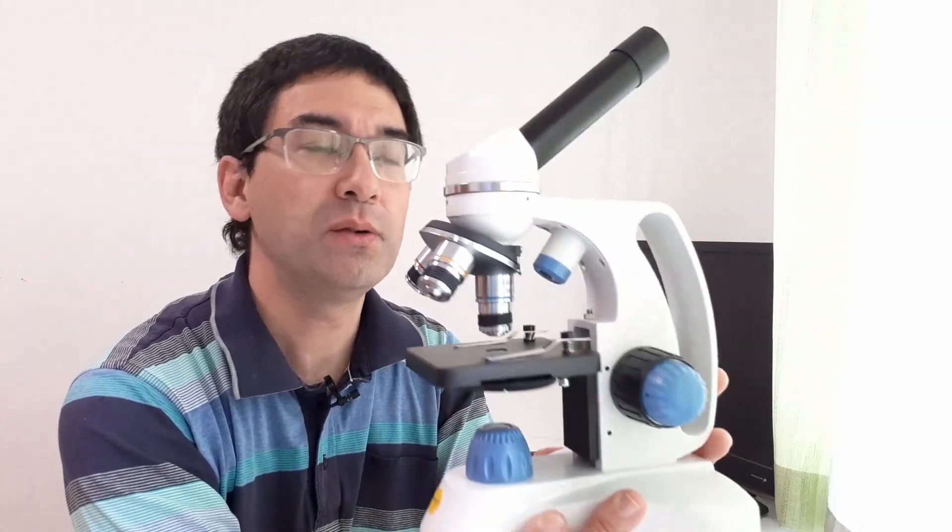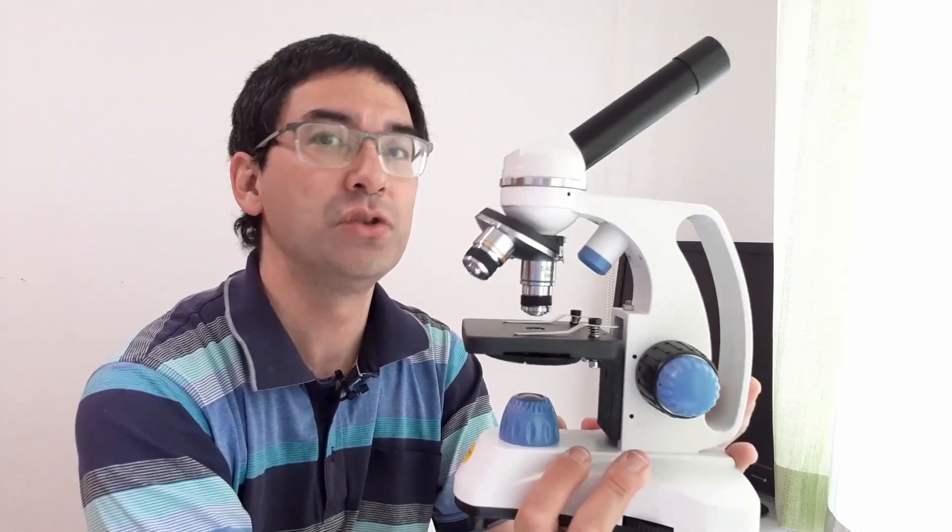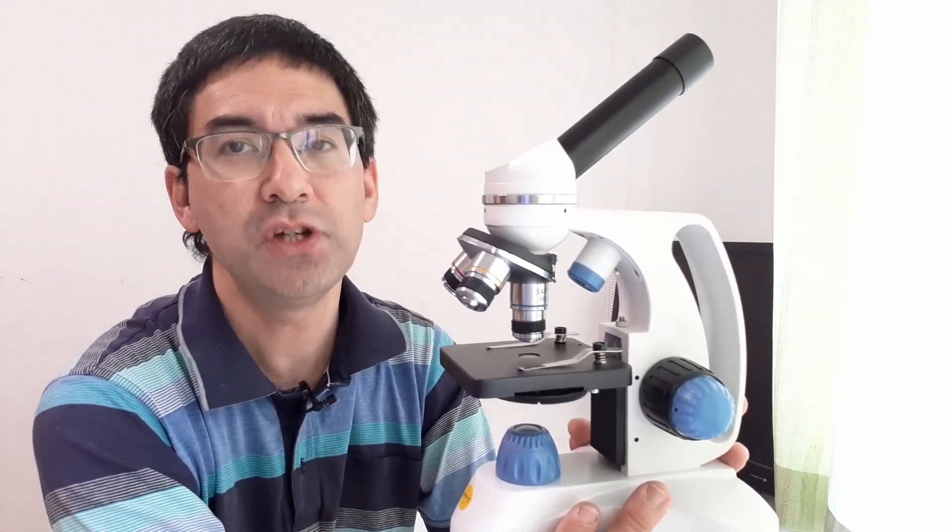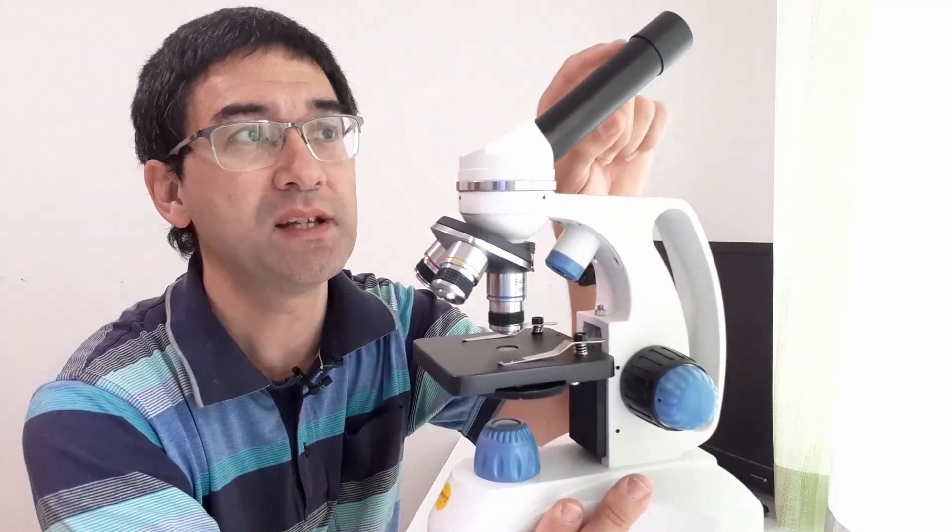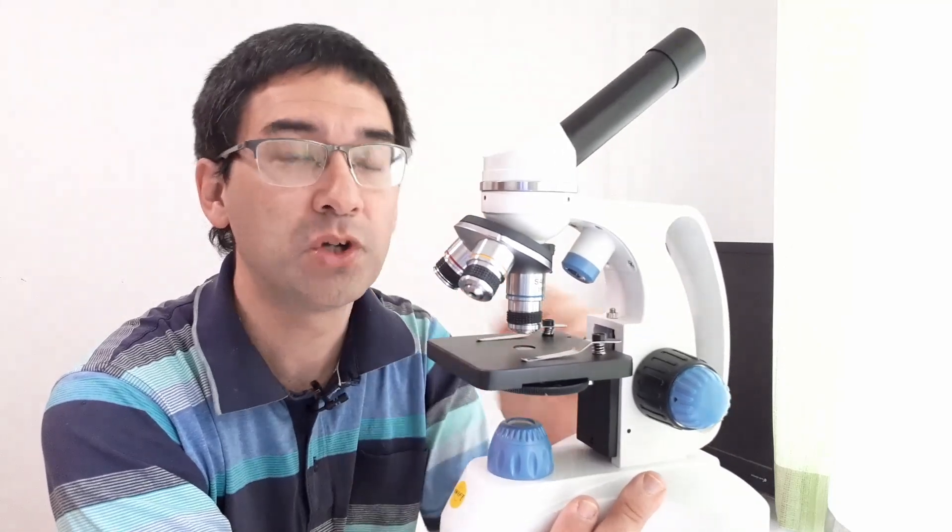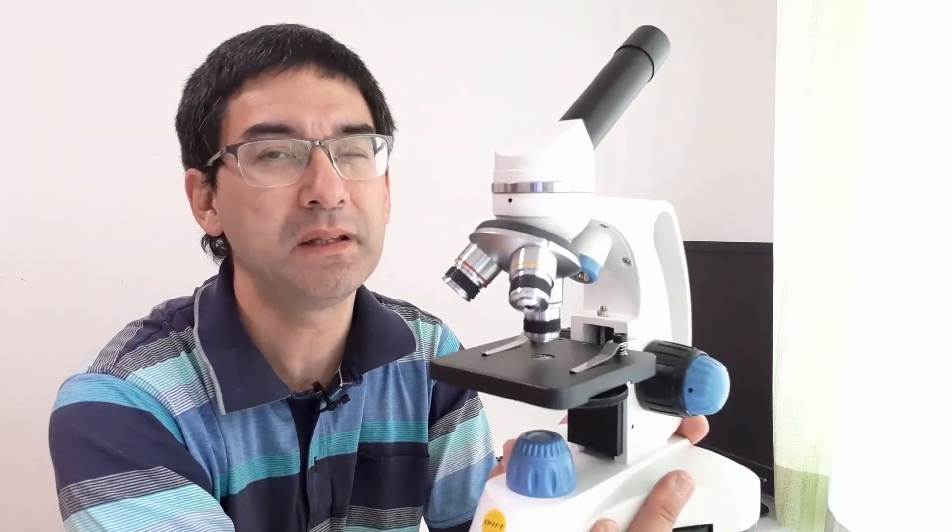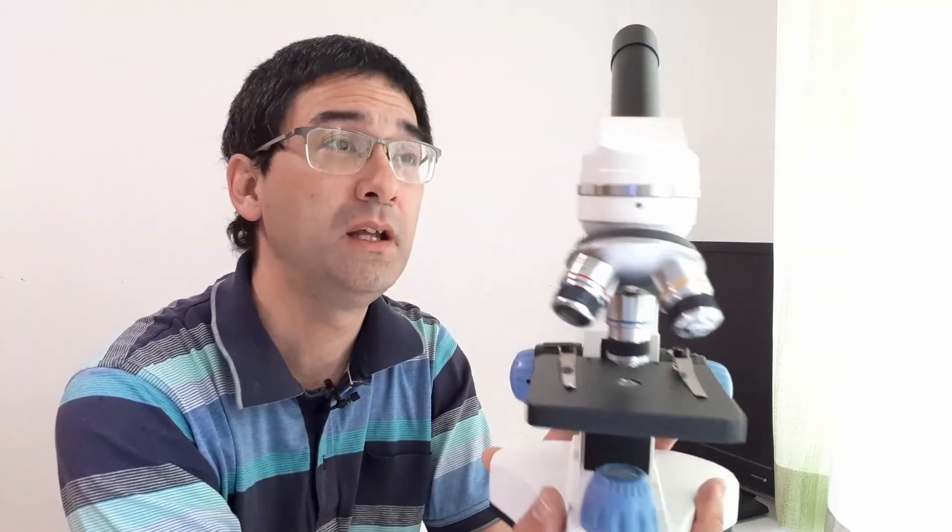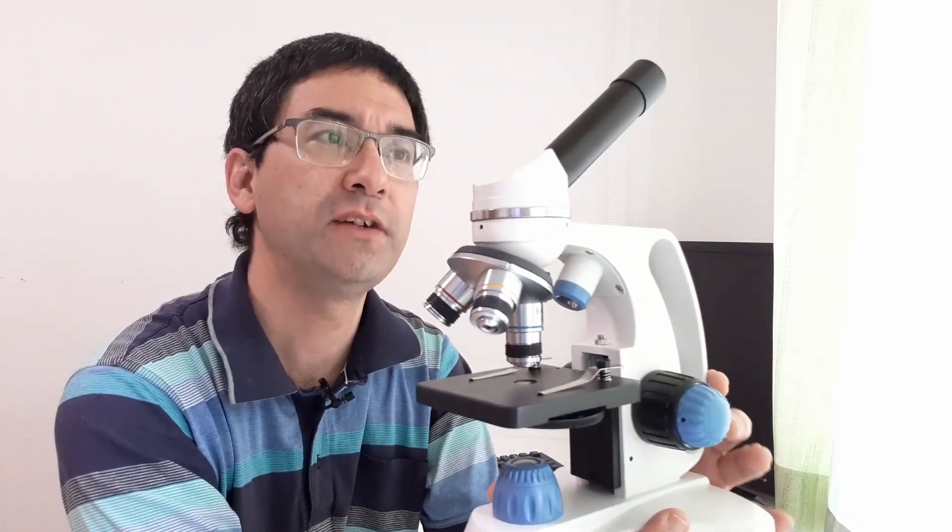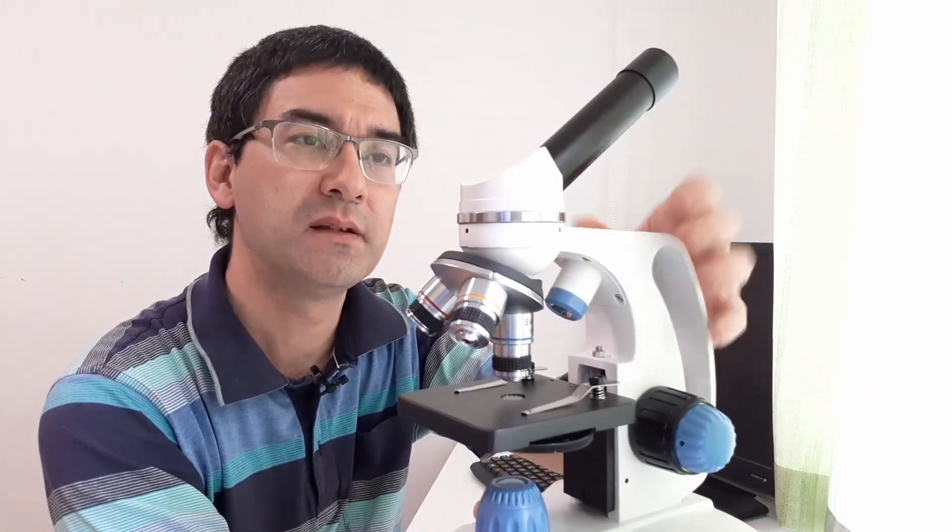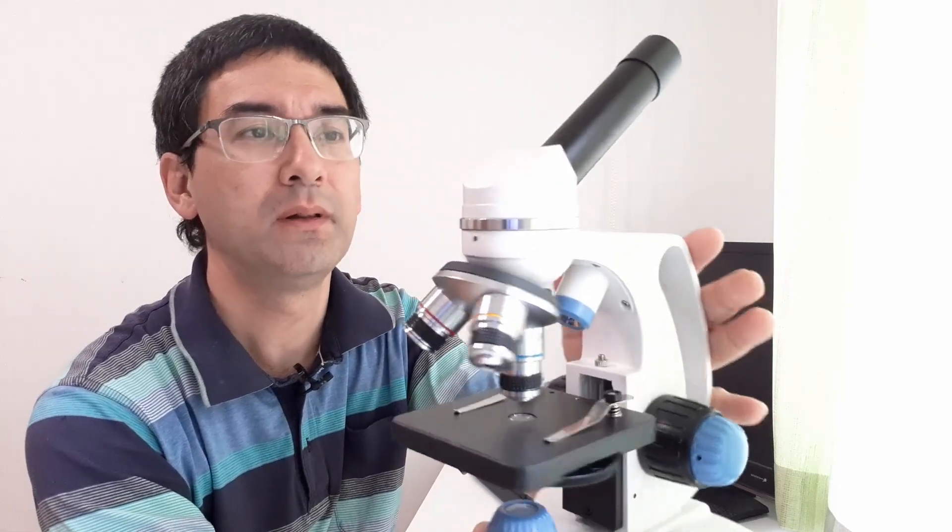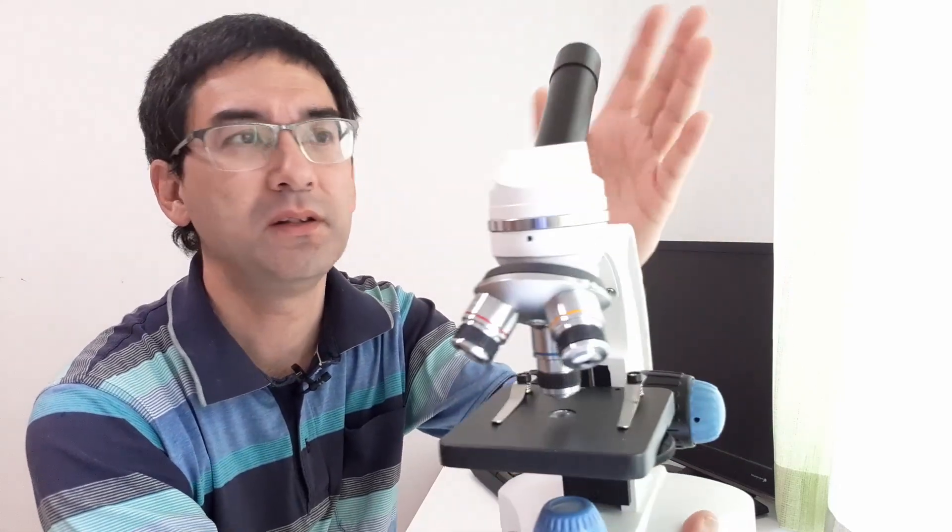What are some of the disadvantages? Well of course there are always disadvantages. No microscope is perfect. One disadvantage is it only has a monocular tube. This means you can only watch with one eye, especially when observing for many hours with a microscope. This is a little bit tiring always to look through with one eye. In this case a binocular microscope is of course much more convenient. On the other hand, monocular microscopes have the advantage it makes it cheaper, it makes it lighter, it makes it more portable and sometimes that's the only thing that you actually need.